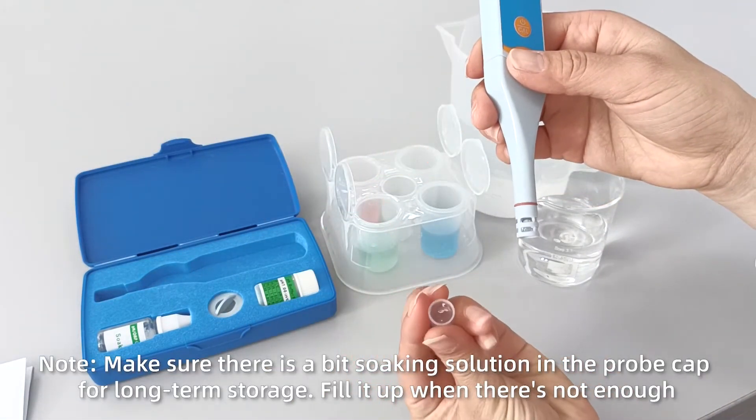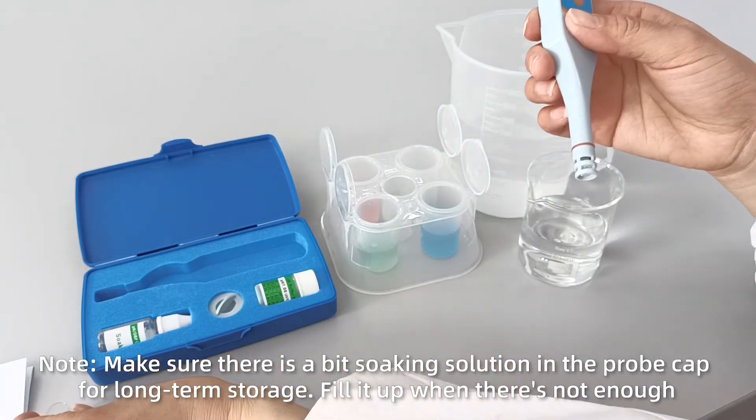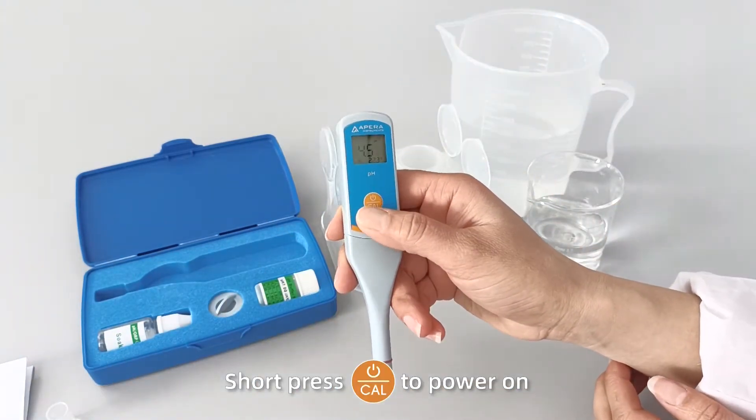Note: make sure there is a bit of soaking solution in the probe cap for long-term storage. Fill it up when there's not enough. Short press the button to power on.